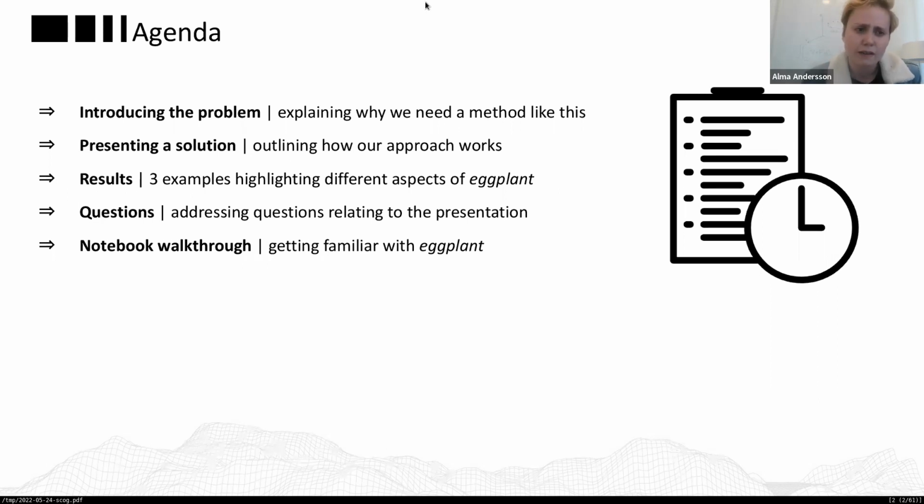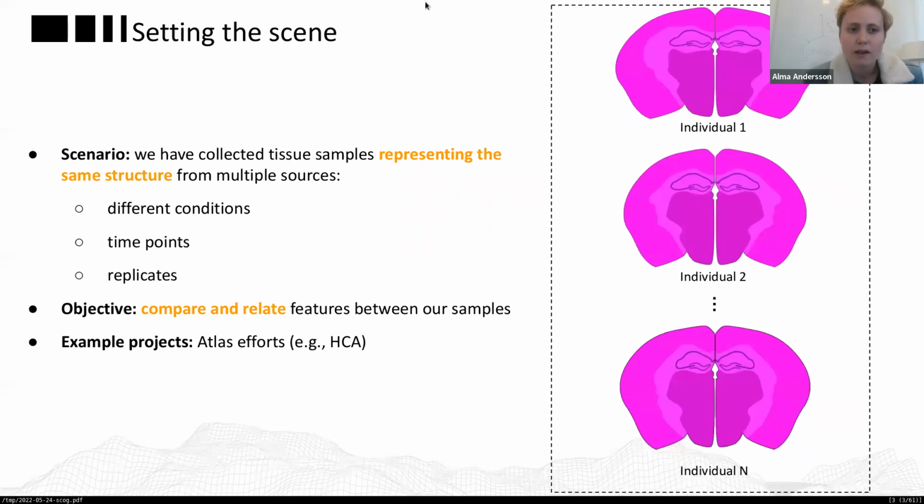And then I think that will round off the theoretical part, and I think that's a good time to have some questions addressing things related to the presentation. And once that's done, we can continue on to do this walkthrough of the notebook, getting familiar with Eggplant. And of course, then you're free to ask questions on Zulip or via Zoom, I guess. So yeah, with that being said, let us set the scene a bit here.